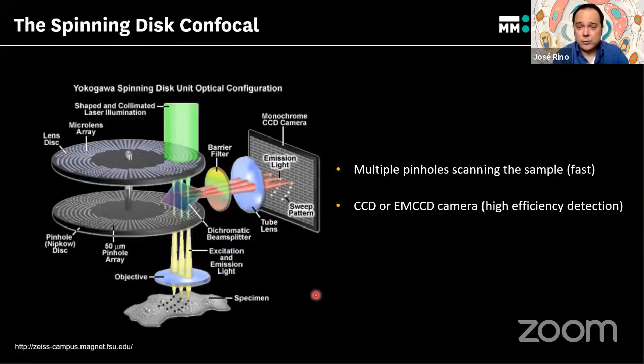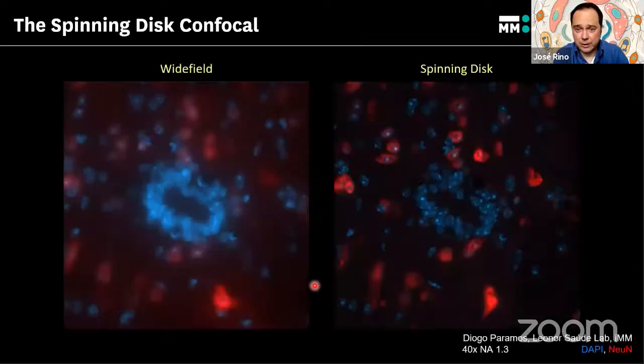This is also good for photobleaching, because your electrons that will be undergoing the fluorescent cycle will not be continuously being excited and emitting photons, risking being photobleached by being just stripped away from the fluorescent molecule. This way of illumination in short cycles is actually better for preventing photobleaching. So spinning disk illumination and detection is the most user-friendly for live cell imaging.